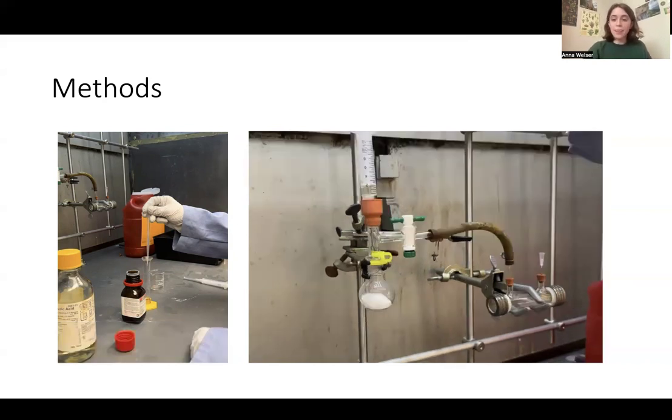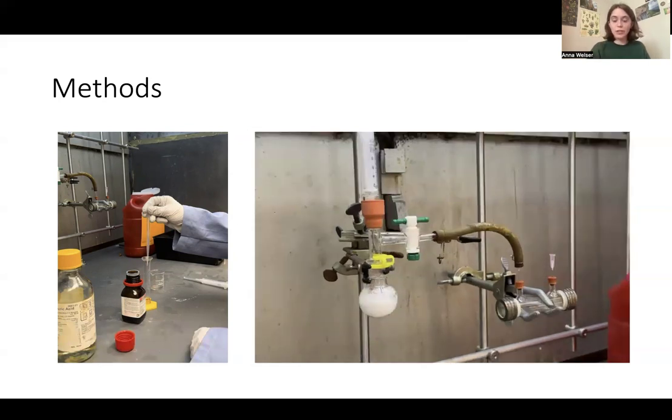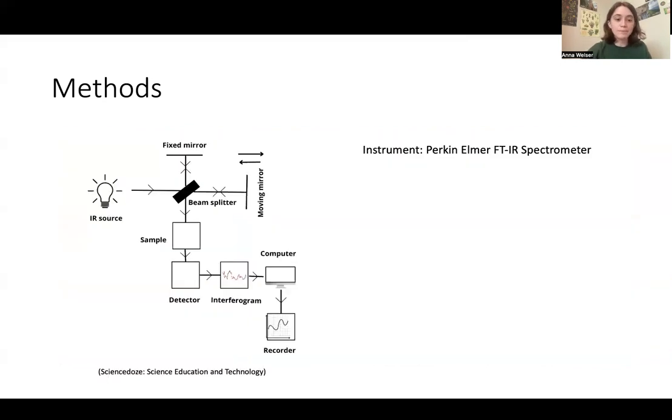So we're going to get this sort of frothy mixture, and you don't want that to exceed half of the volume of the flask. It unfortunately did, but at that point, it's important to absolutely make sure that it does not enter the gas collection chamber and to make sure that you do the appropriate cleanup. Thankfully, it did not, so we can look at our methods and our data.